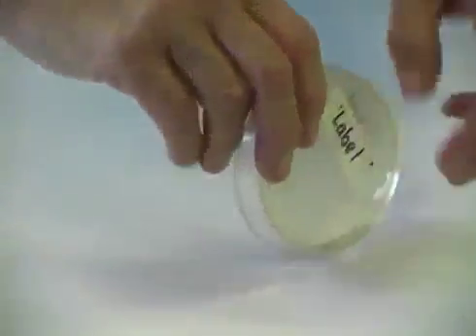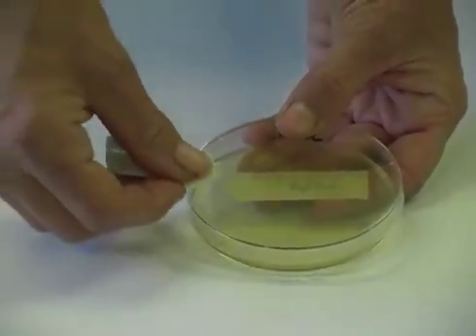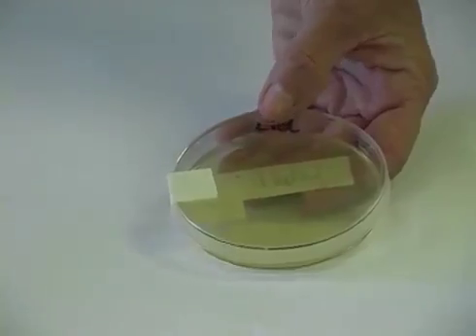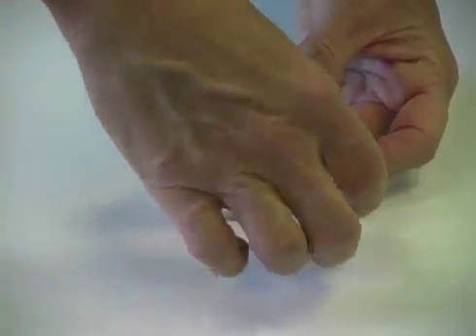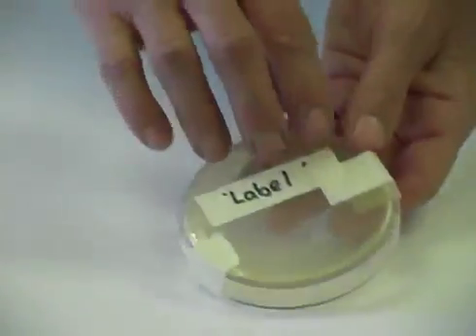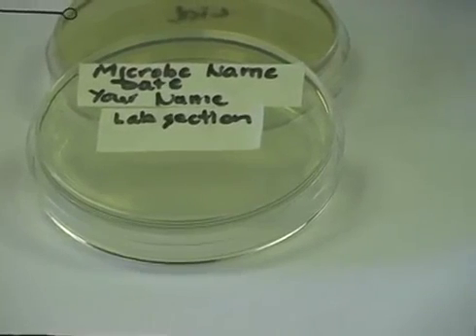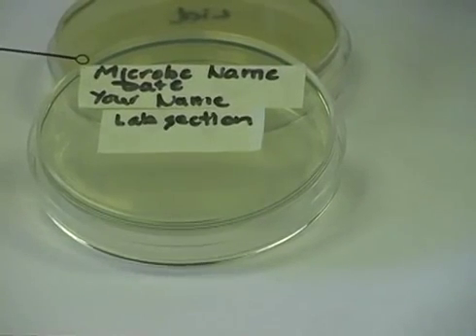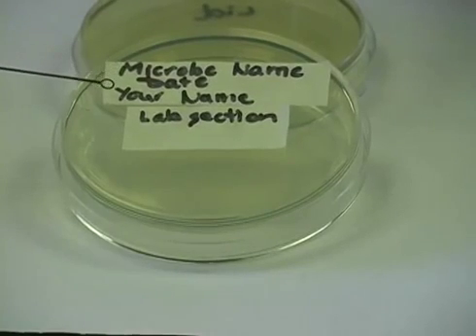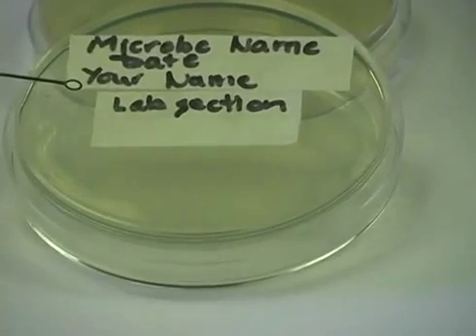Before incubation, agar plates should always be taped shut. And when we incubate our agar plates, we always invert them or turn them upside down, so the label is pointing upwards. Information that needs to go on the label includes the microbe name or the sample name, the date, your full name, and the lab section to which you belong.